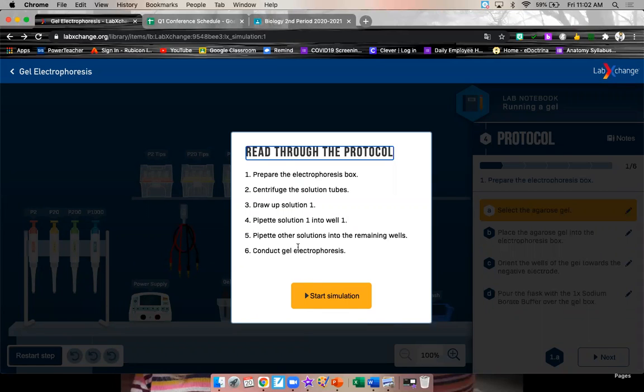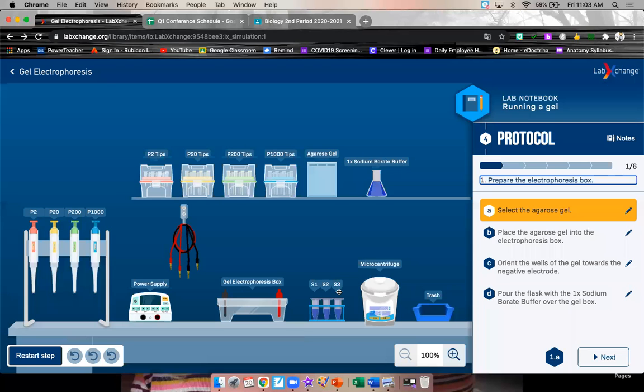So what are we going to do? We are going to prepare the electrophoresis box, centrifuge the solution tubes, and we're going to spin them around, draw up solution one, pipette solution one into the well, pipette the other solutions into the wells, and then conduct electrophoresis. So let's start.